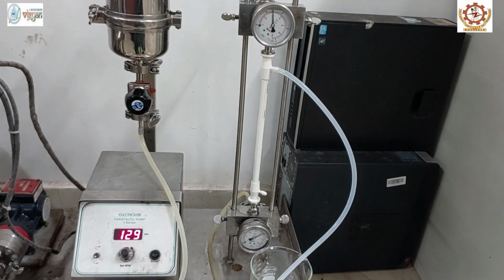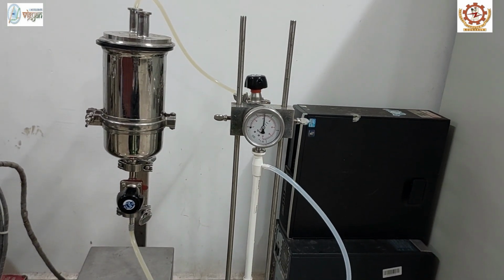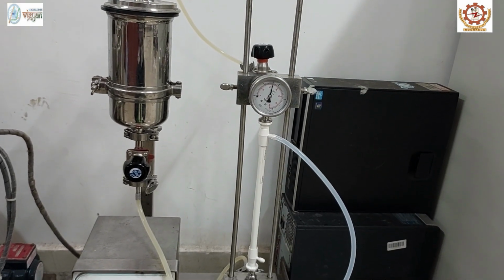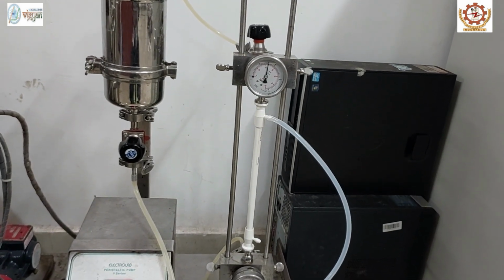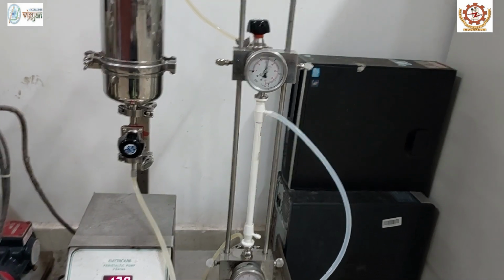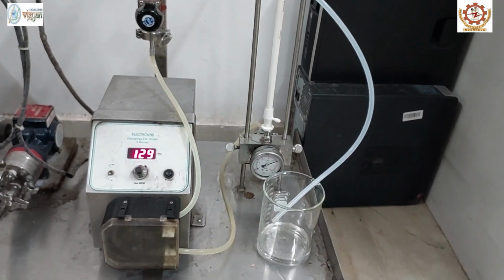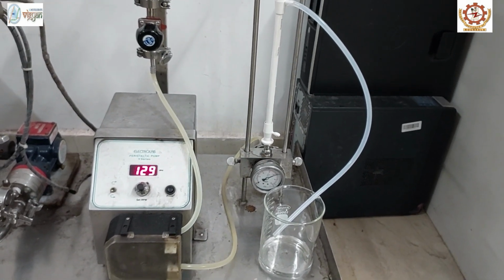Citric, oxalic and hydrochloric acid are the generally used acid solutions with a pH in the range of 2 to 3 for the effective removal of the inorganic materials. Similarly, sodium hydroxide solution with a pH range of 10 to 12 is the commonly used alkali solution for chemical washing of the membrane. Initially, the procedure that we follow for membrane washing is as follows.